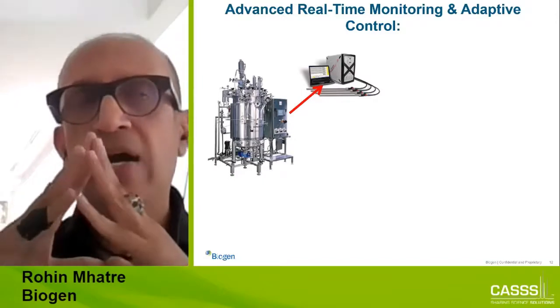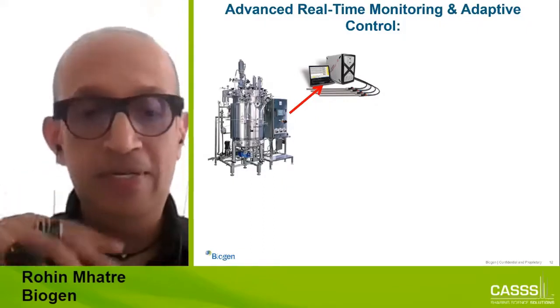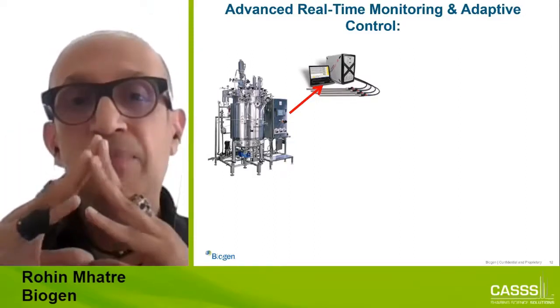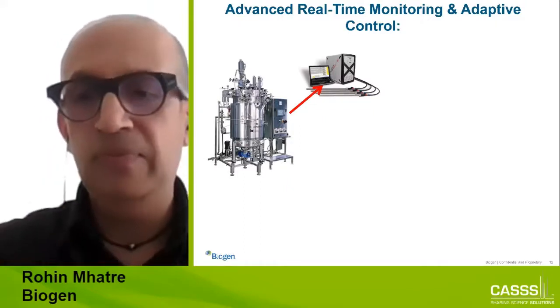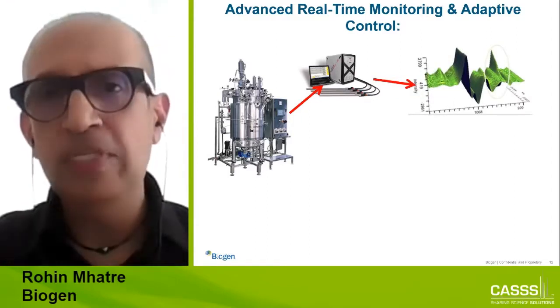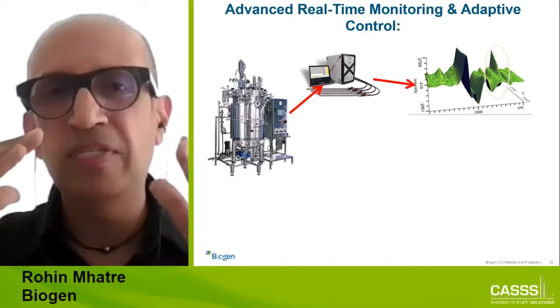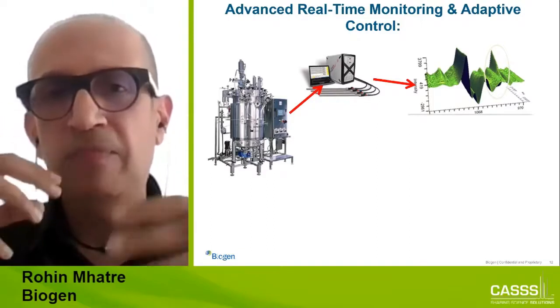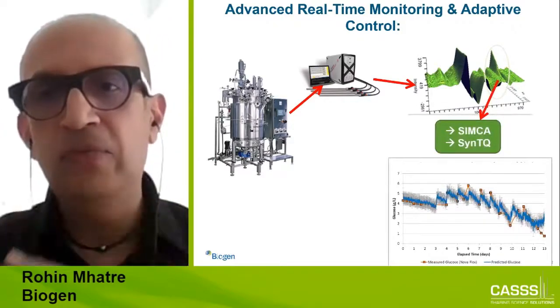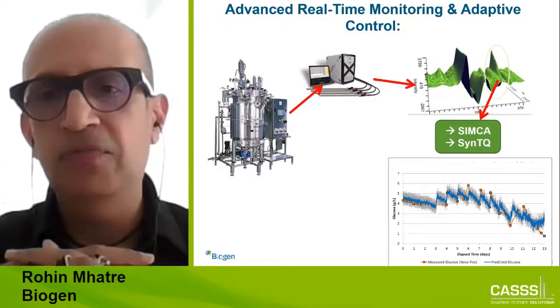But what we have found is that with basic tools like Raman, there's a lot of information. Even when I was in the lab, some of these things were evident: relatively low background and the ability to monitor a number of things, and we're talking about glucose here, lactate, what have you. The advantage of using sensors like this is that in a complex spectrum, you are simply looking at areas where some of the differences could be. You can do a lot of this work by simple training experiments. But once you find these differences, then it's a matter of using all the other sophisticated tools that are used in manufacturing, conversion of the data and so on.